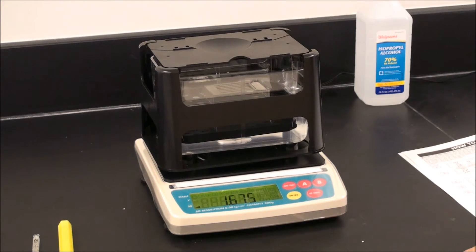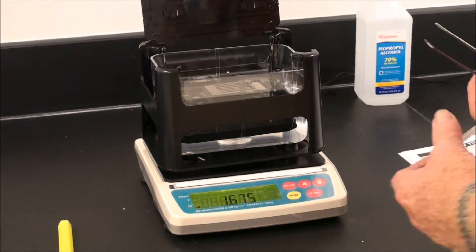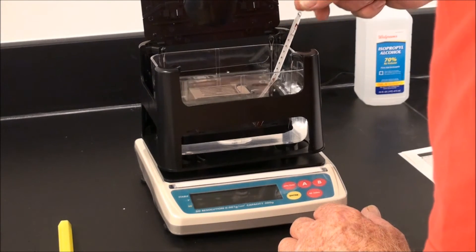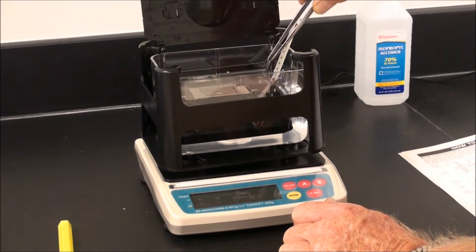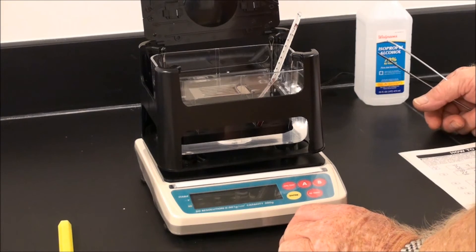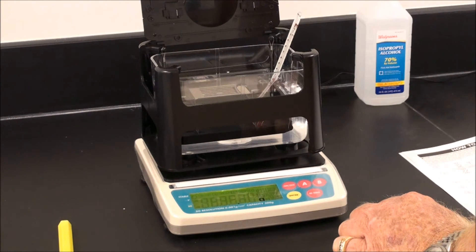Standard temperature is 4 degrees C, although most labs are not at that standard temperature. To compensate for this, you have been supplied a precision thermometer. Remove the power, place the thermometer in the bath, and allow it to stabilize. The system is set around 20 degrees C. We can see the current temperature is 24 degrees C. Turn the balance on — it is set around 20 degrees C.